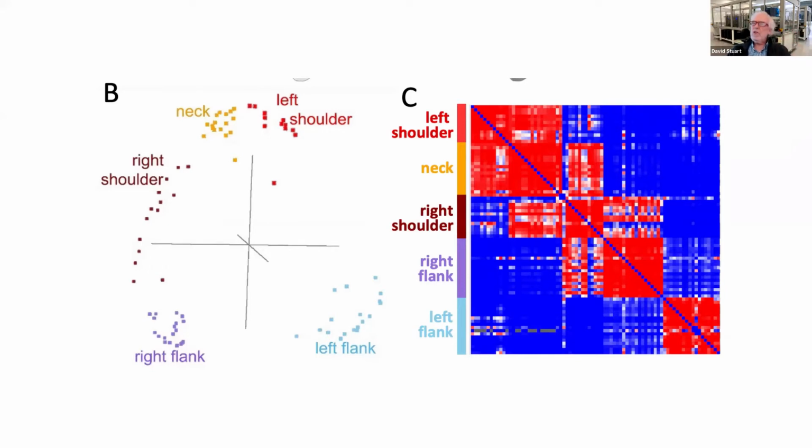So that's a competition experiment. And this is a fantastic heroic effort by Darming in the lab, who used a 96-well plate Octet machine to do a matrix of comparison between the antibodies. The matrix wasn't quite complete, but he did thousands of experiments.